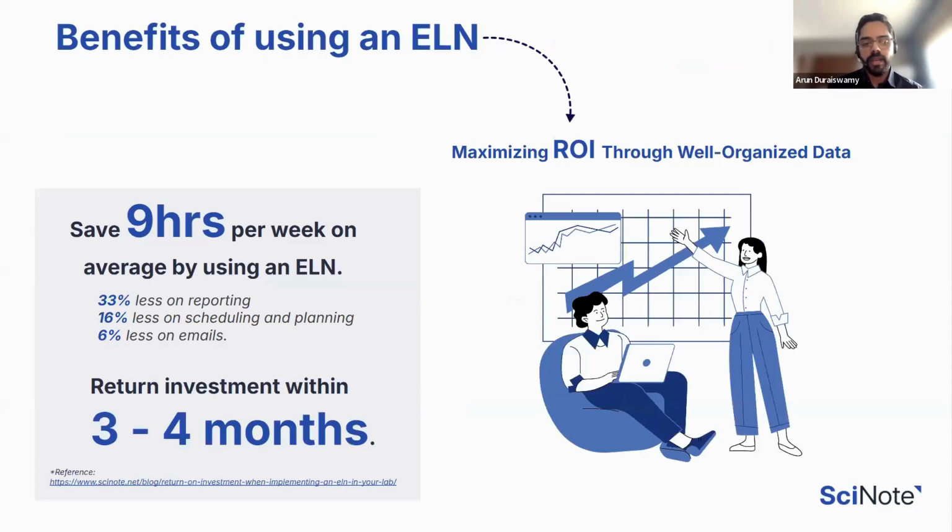Okay, now that we had a quick look at the product development process for your assay kit, how does an ELN benefit you during each of these phases? The main message that I would like you to take away from this section is, if you invest time and resources in establishing a strong data management foundation, it can yield ongoing benefits throughout your product lifecycle. And we'll take a quick look at this in more detail in the following slides. We'll first start with the research and feasibility phase.